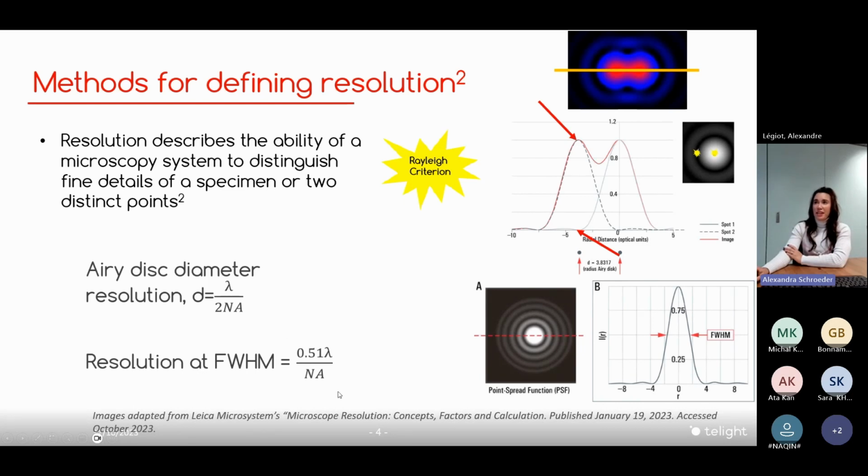But another way to measure and assess it, considering this airy disk, is with an equation that is very approximate to the one just above it. Here we consider that you can approximate the resolution as the full width at half maximum across these points as well.